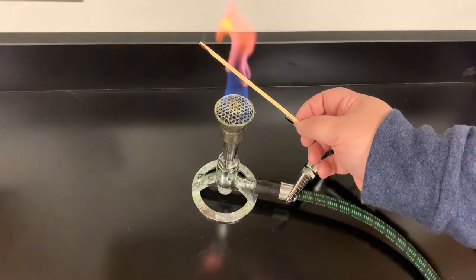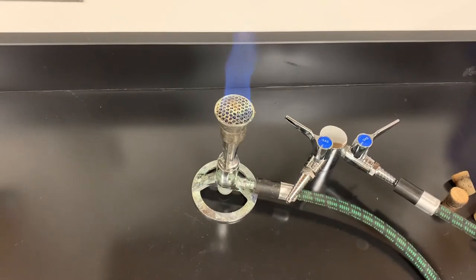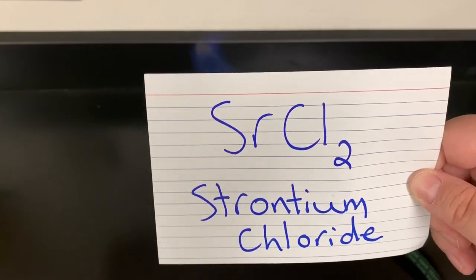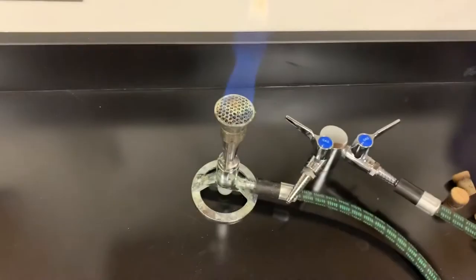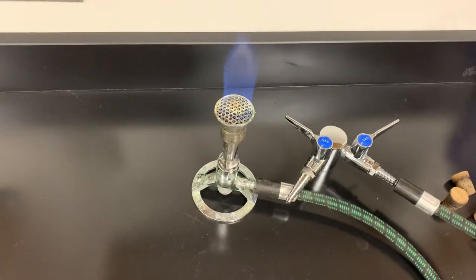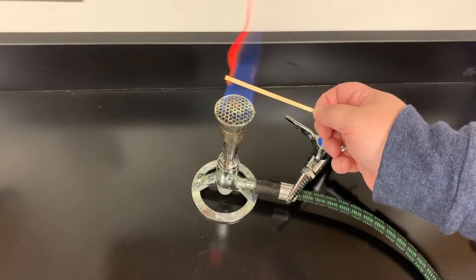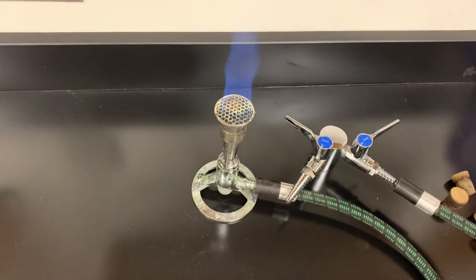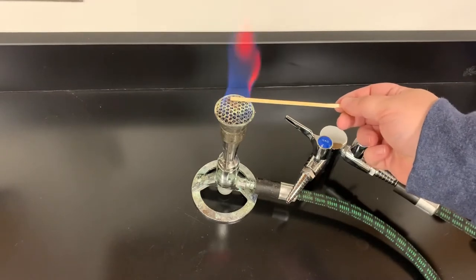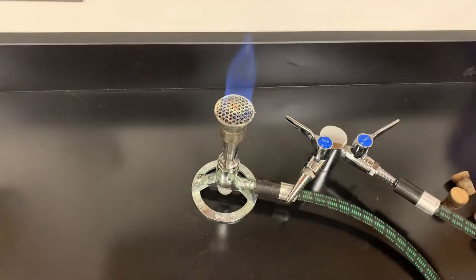A light purple color — that's characteristic of potassium. Our next one is SrCl₂, which is strontium chloride. It turns the flame a red color — a nice deep red for strontium.